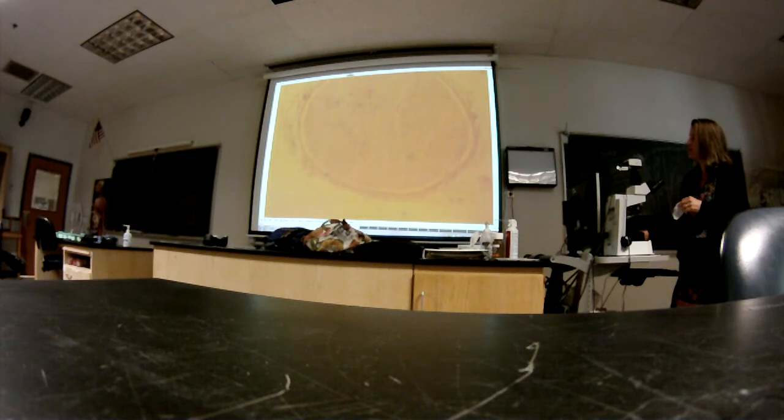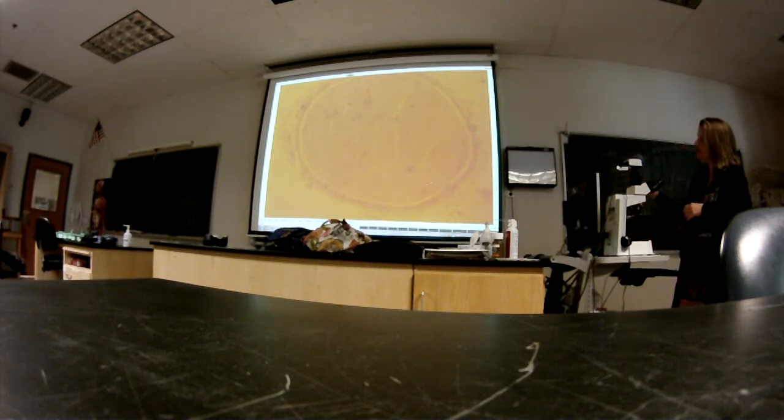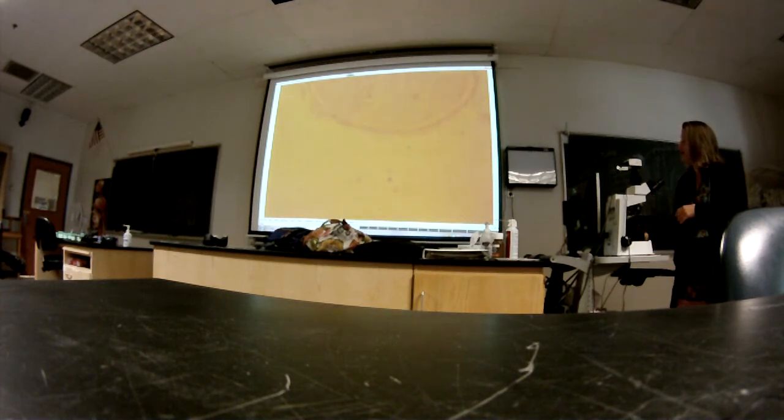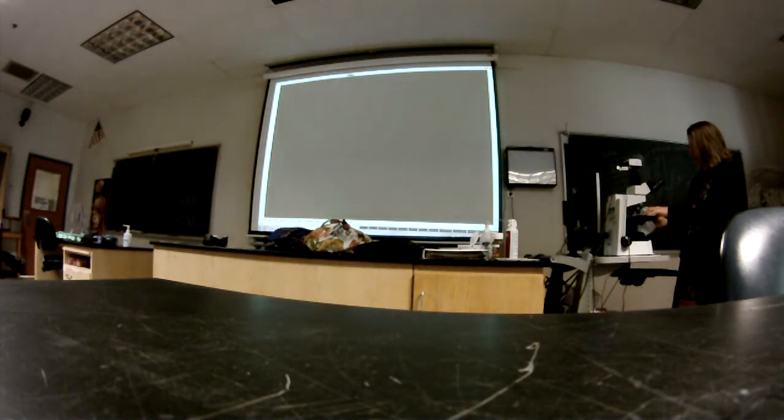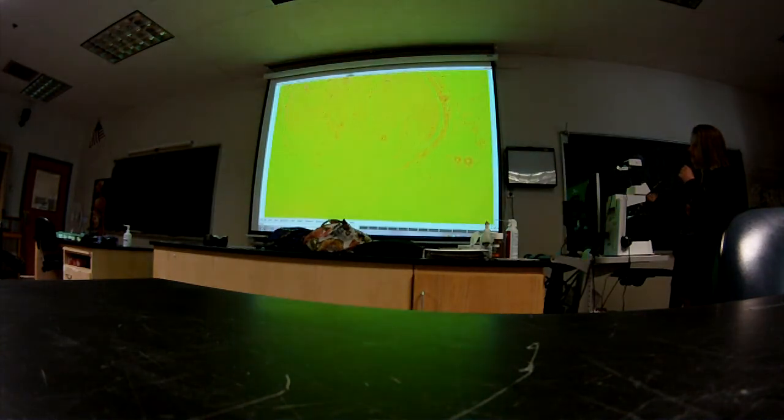And so then we have these structures, which are not that good on this one. We have these groupings of structures which are pretty ill-defined on this one except for down here. Let's look at that one. Goodness, this is just so dirty or something. Okay, and so, yeah, there it is.